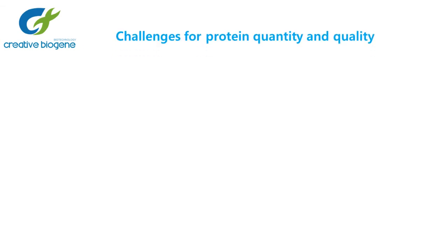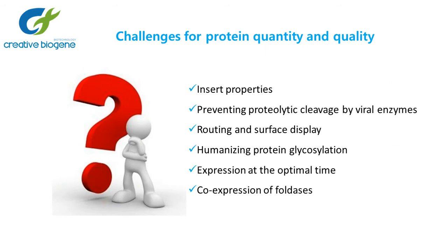The challenges for protein quantity and quality are listed below. Insert properties. Preventing proteolytic cleavage by viral enzymes. Routing and surface display. Humanizing protein glycosylation. Expression at the optimal time. Co-expression of foldases.